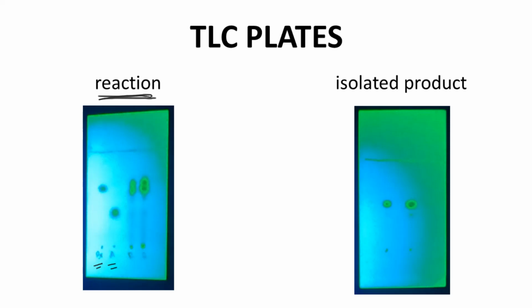When I took this TLC, my interpretation was that the aniline was completely consumed or nearly completely consumed. There is a shadow in the reaction lanes that lines up with the aniline. So since one of the reagents is consumed, the reaction is done. I did file away in my head that the reaction likely still contains some of the aniline.